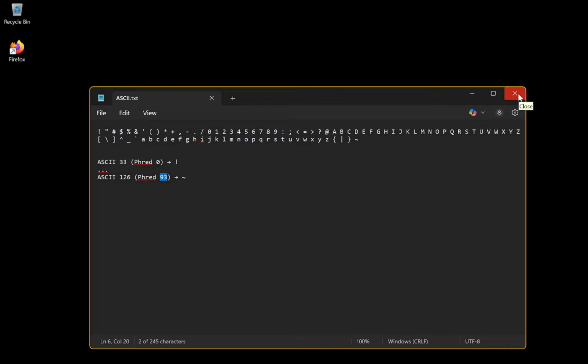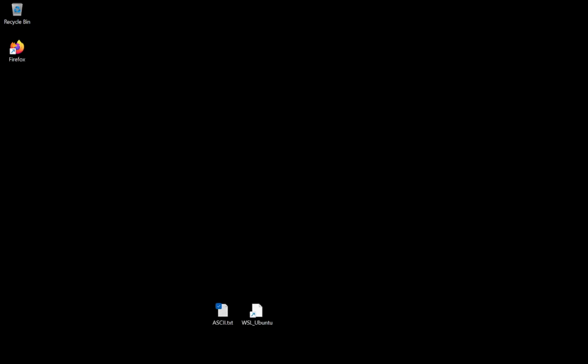And this is basically it. This was about the raw data. Next we'll learn about the filtering and trimming before alignment.